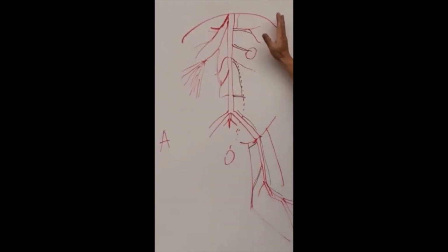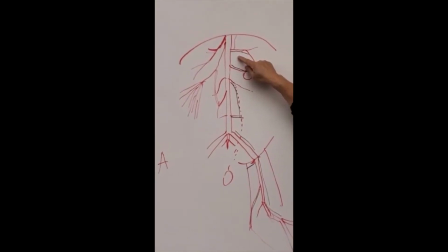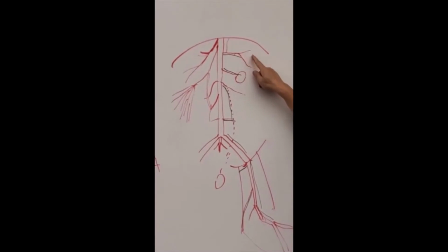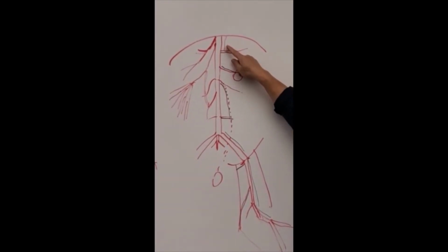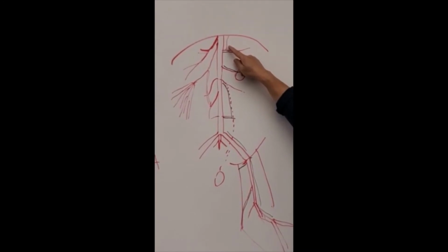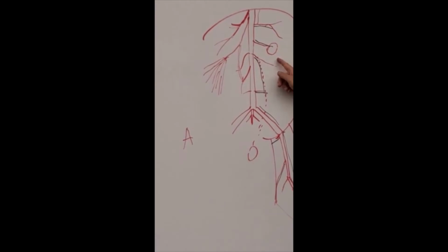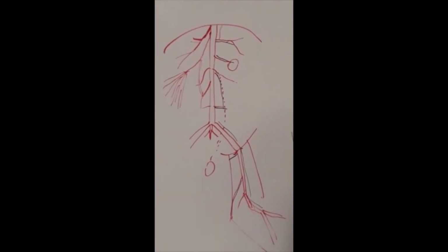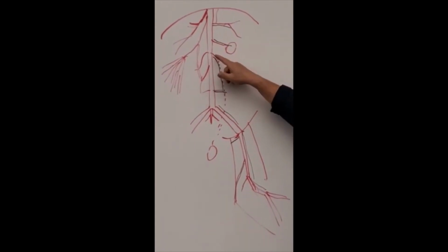On the right side, you have adrenal lumbar. Because the adrenal gland is over here. Okay. Adrenal lumbar forms this fork over here. There's an early branch going up, supplying the diaphragm, we call it phrenic. Okay, you're going down a little bit, easily you'll find the renal supplying the kidney. Okay, you're going down a little bit, you find gonadal.